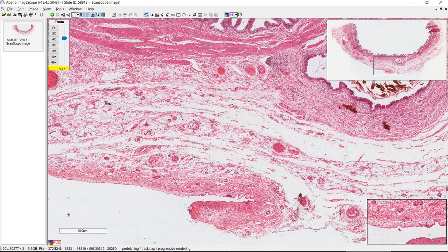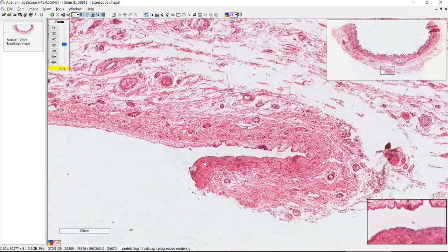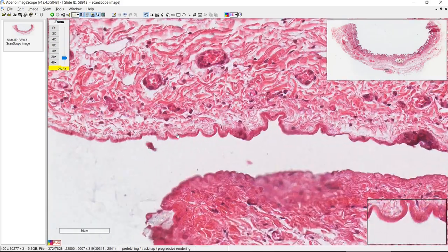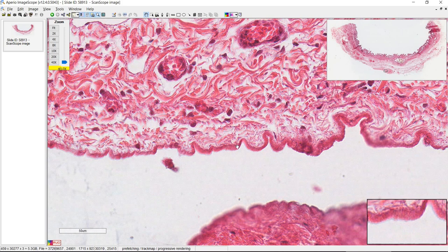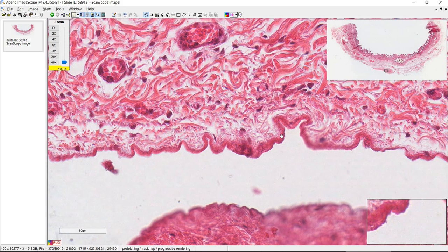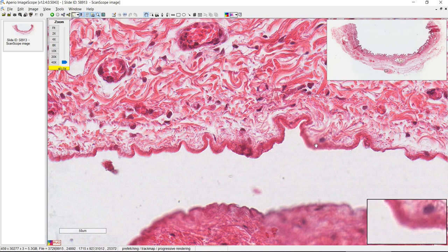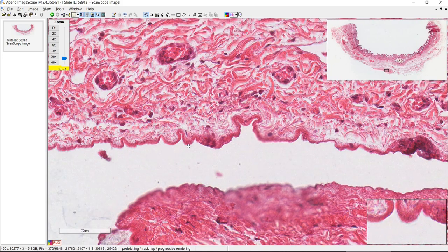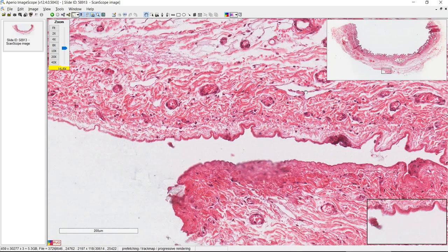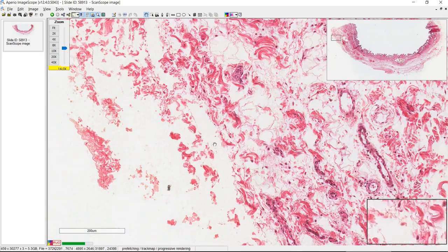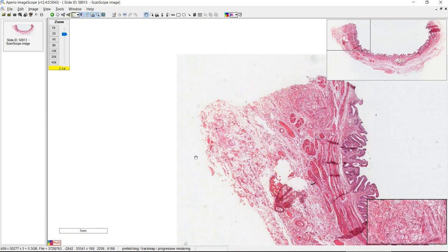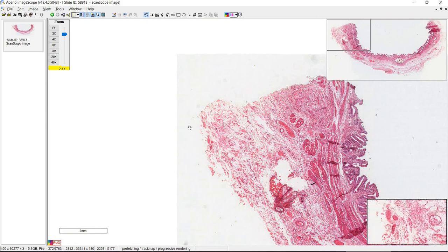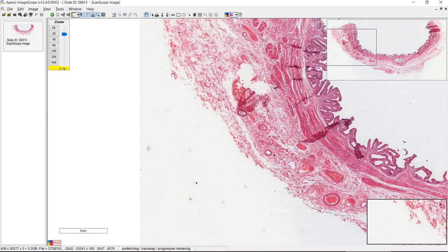Here you can see this is all serosa, and you can tell because if you look closer at the end of it, you can see a well-defined mesothelium. You don't really see the nuclei too well here, but this is a simple squamous epithelium that marks the end of the organ. Compare that to the area where it's ripped off — that might be an adventitia where it's adhering to the liver.